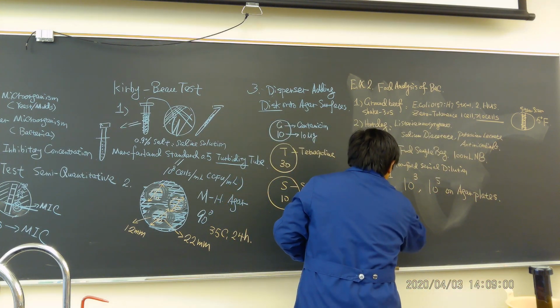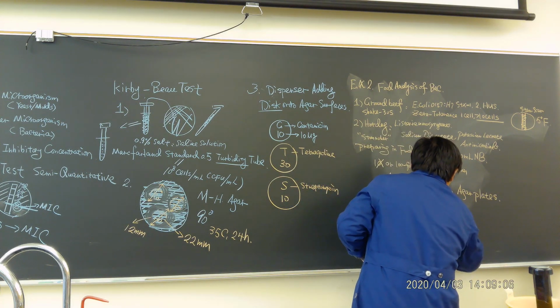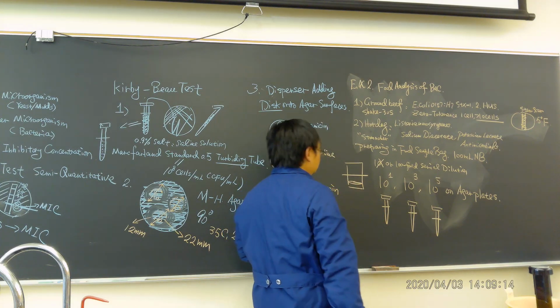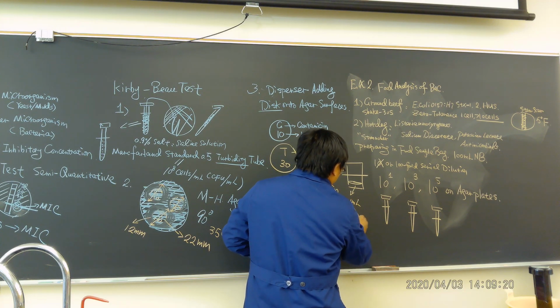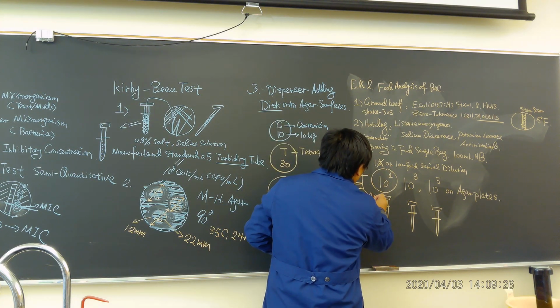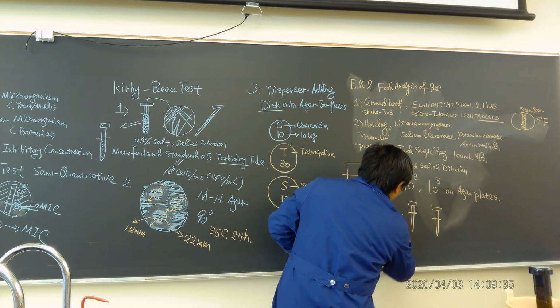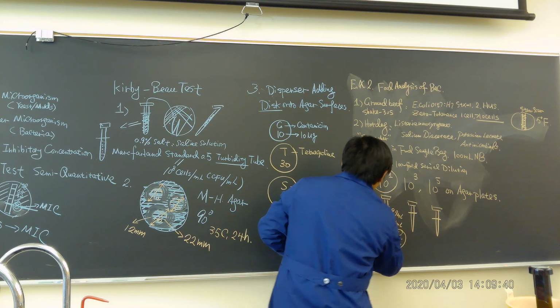Remember, you're going to get those tubes. How to do it? This is the original sample bag. You have a hot dog there, let's say. If you add 0.1 ml onto the agar plates, that is 10 to the 1. Then if you add 0.1 ml onto 9.9 ml buffered peptone water, and 0.1 ml of that goes to the agar plates, that is 10 to the 3rd. So we need pipettes.